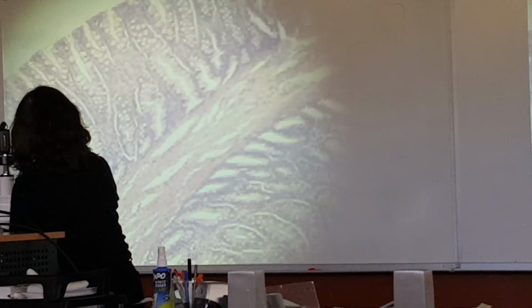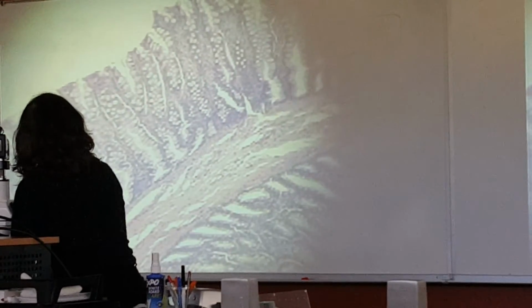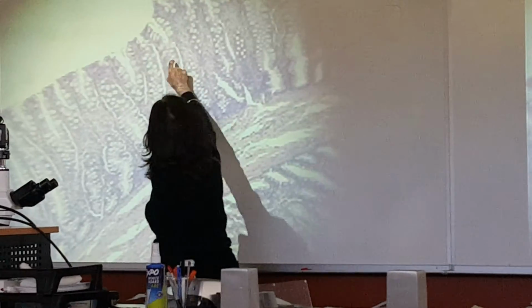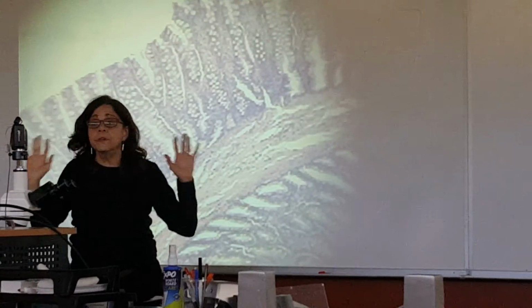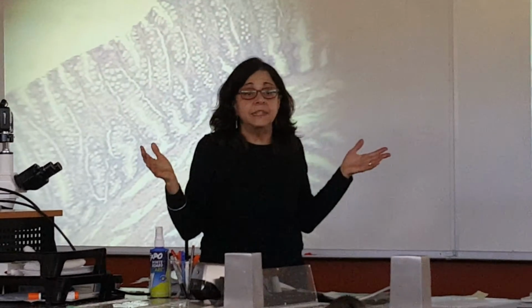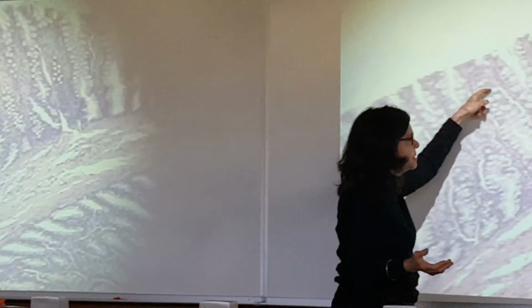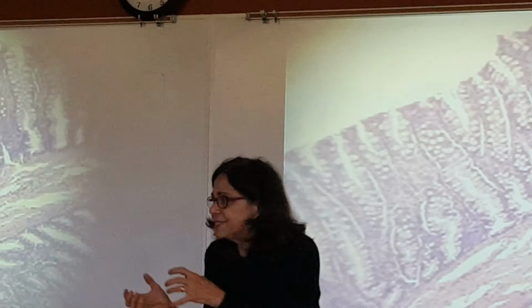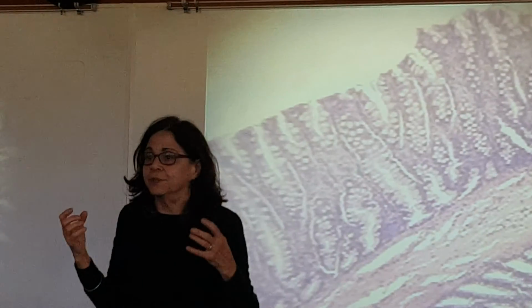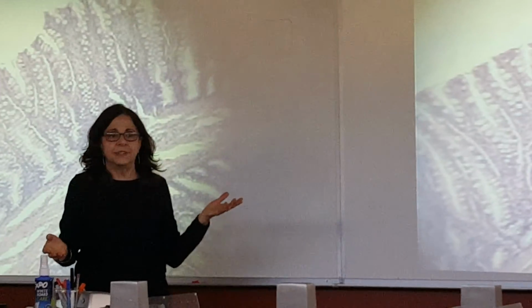And the thing that's going to tell you that it's the colon are these, which are goblet cells making mucus, and more than any other part of what we've seen in terms of the slides we've looked at. So there's huge numbers of goblet cells, because that feces really needs to be surrounded by mucus to help it get out without scratching you or something. So we're looking at what saves us from that kind of pain in terms of the defecation.